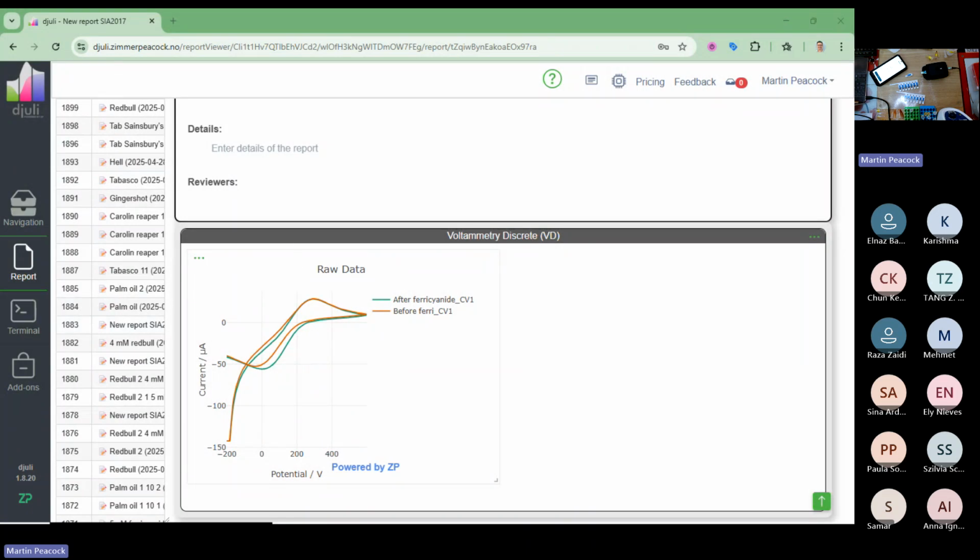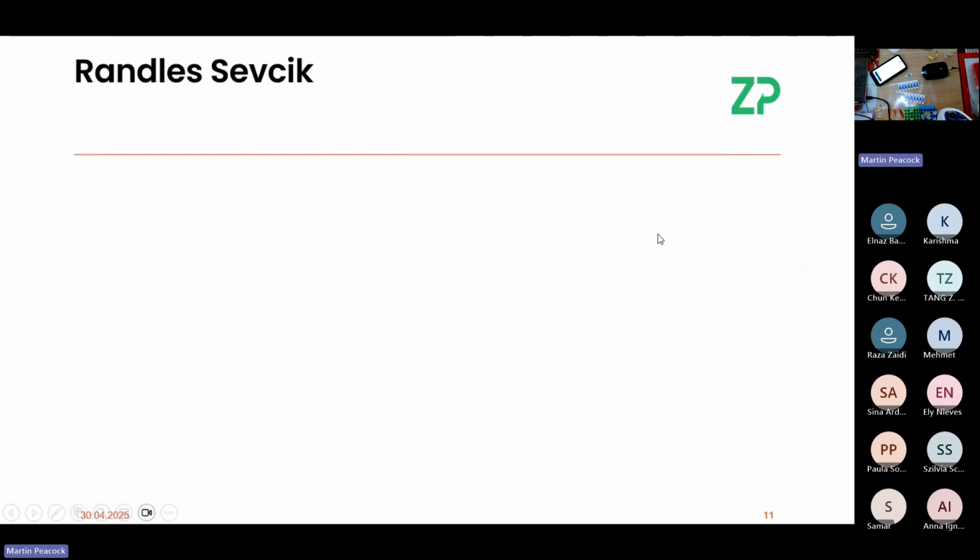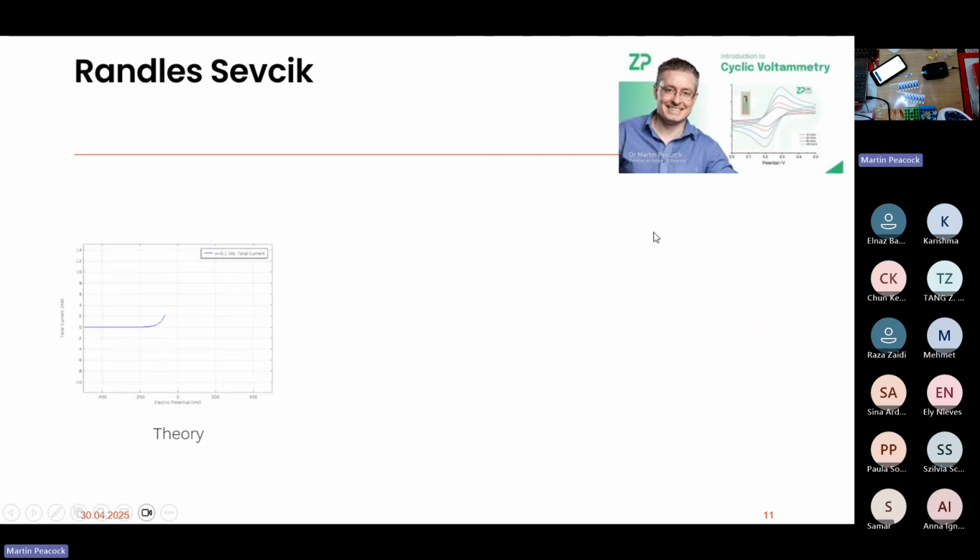So now I'm coming closer to the end. I can see somebody's typing a question, so I will try and pick that up. I just want to talk about Randles-Sevcik very quickly. This is a bit of a classic. I do have some videos about Randles-Sevcik.